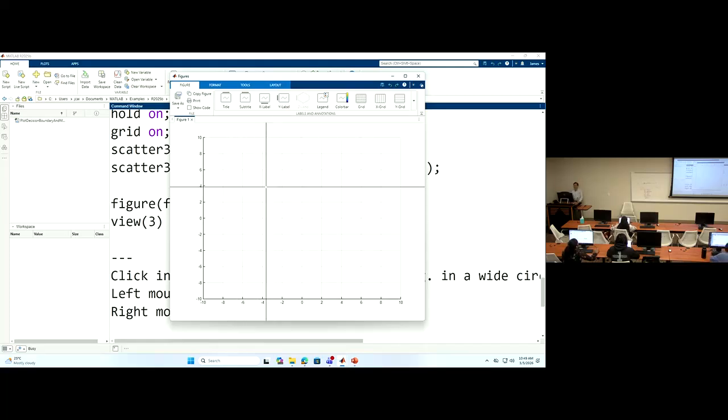Okay. So this is just a small demonstration of the kernel transformation. It allows you, by clicking, to create sample points. So I just click and create this random sample.